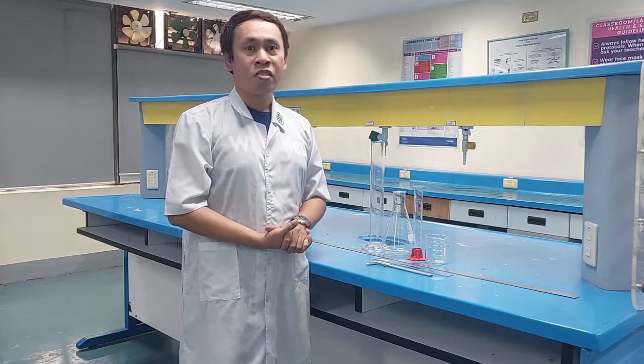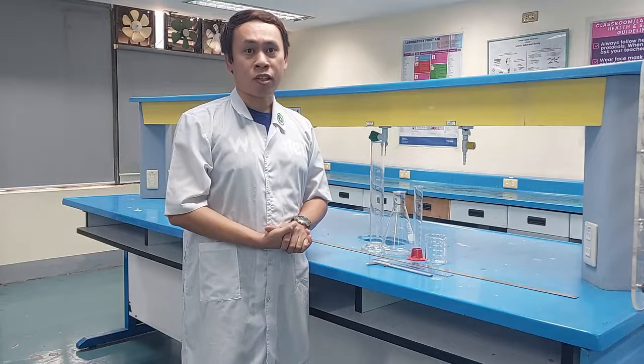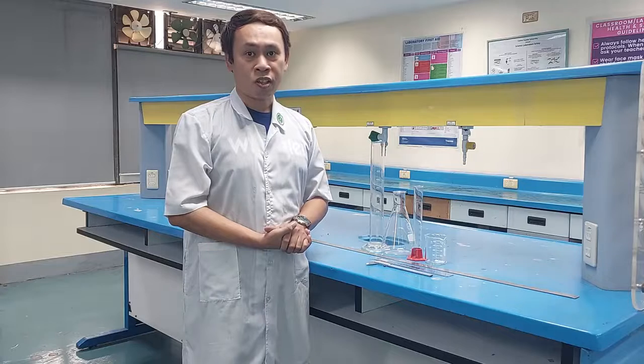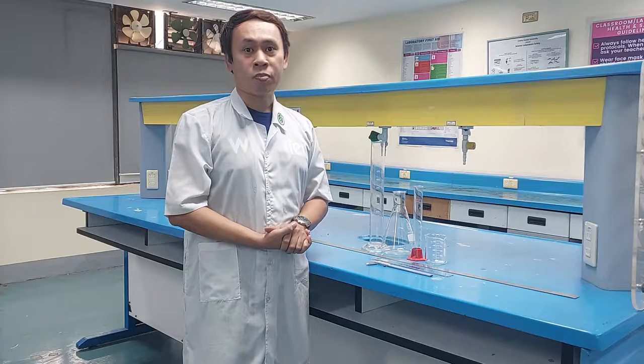Scientists measure mass with mechanical or electronic balances, and the method is straightforward. Various devices are available for the measurement of volume. These include various kinds of pipettes, graduated cylinders, and volumetric glasses. It is important to know which device is most appropriate for a given situation. Your efficiency, accuracy, and precision in making such measurements will improve as you gain experience.